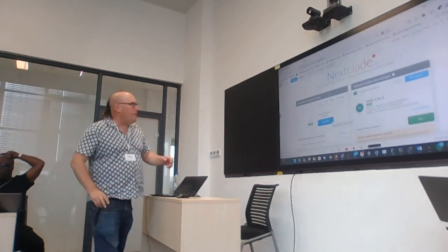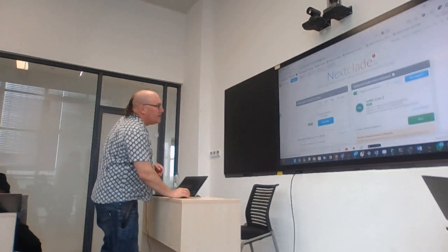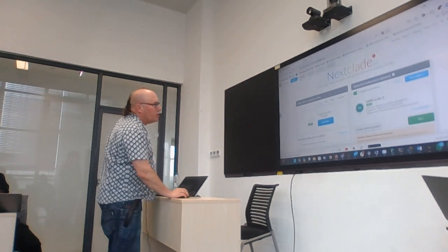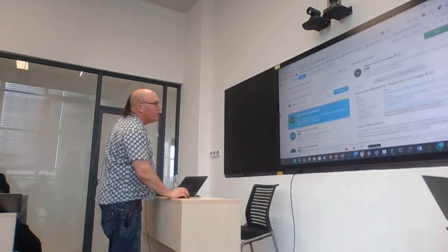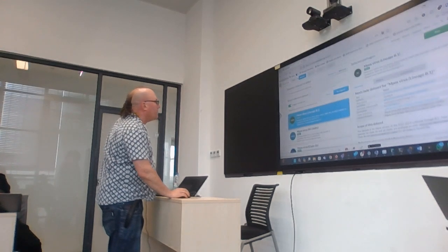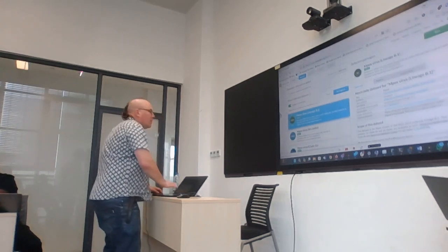And now it says here, oh, this is wrong. That won't work. Change reference dataset. Okay, so now I'm going to go. There was a resuggest option. The resuggest. Okay, let me go back to that. Start again.